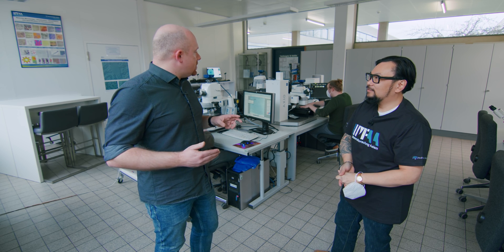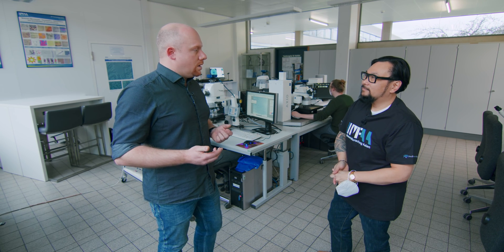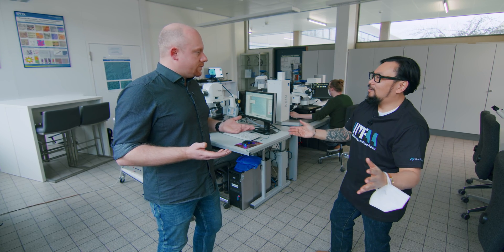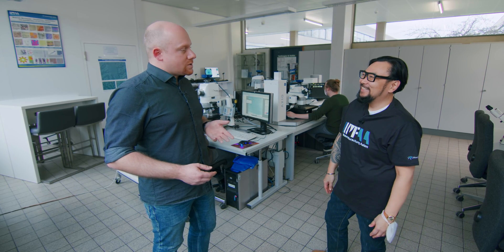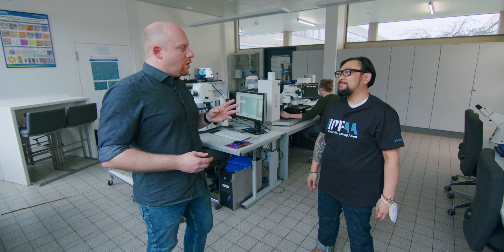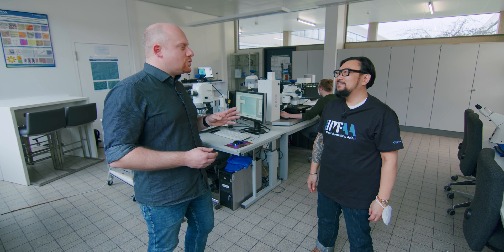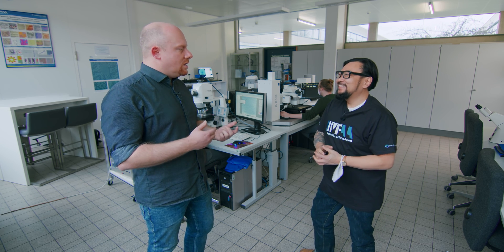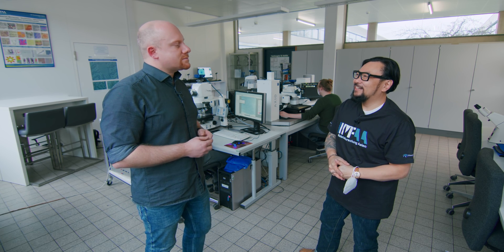We also have confocal microscopy here — the SmartProof — for surface measurements. I love that machine. And also a digital microscope right behind you, the SmartZoom 5. We also have two manual Zeiss microscopes, just for quality control or checking your preparation quality.